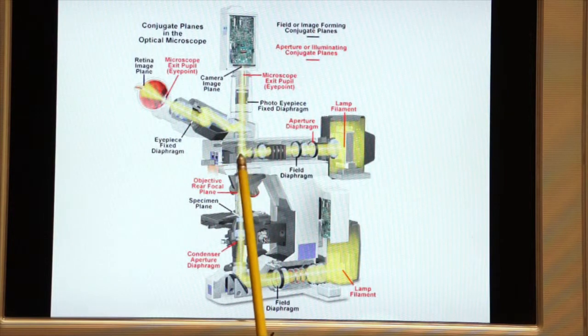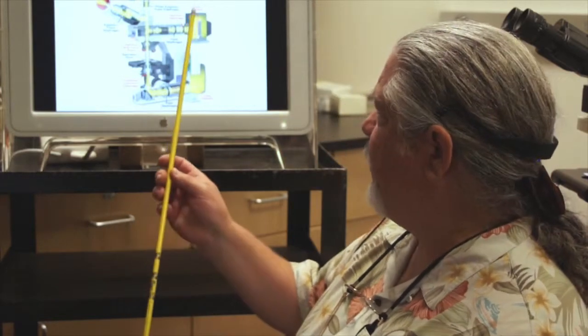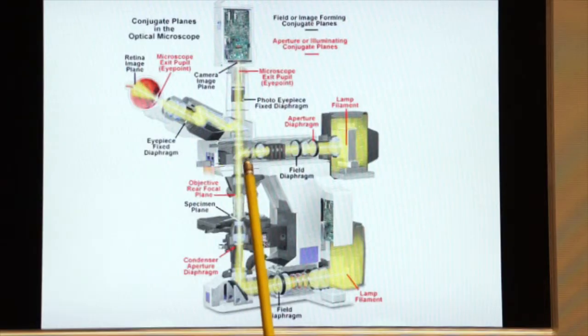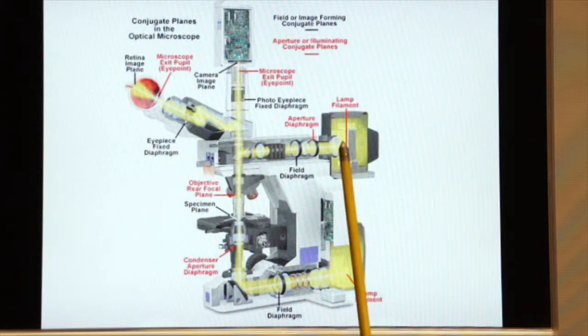Now this microscope also does reflected light. Remember in fluorescence we're using reflected light to illuminate our specimen. So this is the fluorescent vertical illuminator. Here we have the lamp housing, which has that mercury bulb that we're going to discuss more in a few minutes. It produces a lot of light which travels through the vertical illuminator.